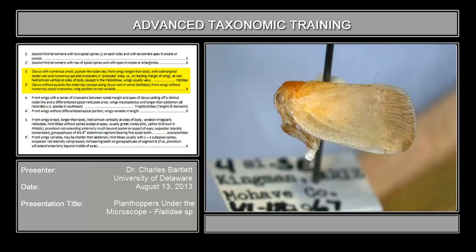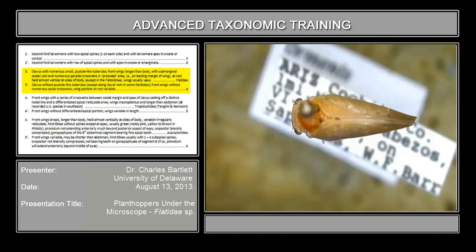The couplet goes on to say that at rest, the wings are held almost vertically on the side of the body. If we look at how one of these sits at rest, the wings are held basically parallel to the body. So this happens to be a flatid. The real key features to the flatid are the presence of those little tubercles in the claval area of the wing, plus the presence of the series of cells in the sub-marginal area of the wing.